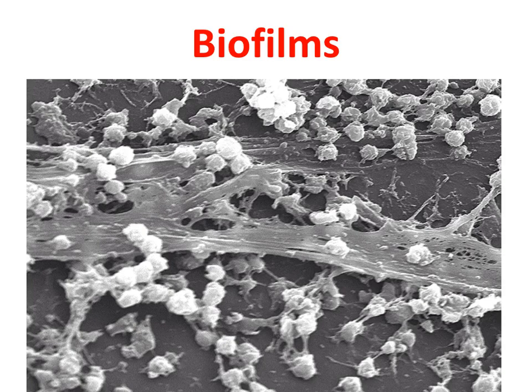This video is the Biofilm pre-lab. Biofilms are groups of microorganisms that are all living together with their secretions, so all the stuff that the cells release. It creates this gooey matrix where all the cells are stuck together, and then they're also usually stuck to a surface. Shown here is a scanning electron microscope picture of that.